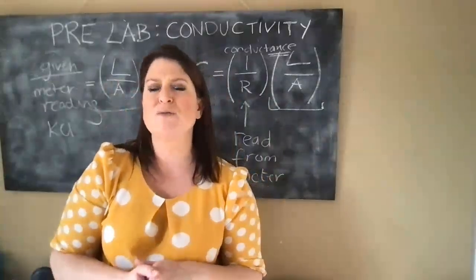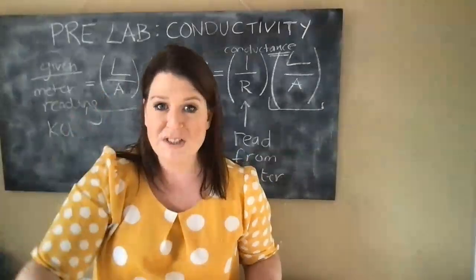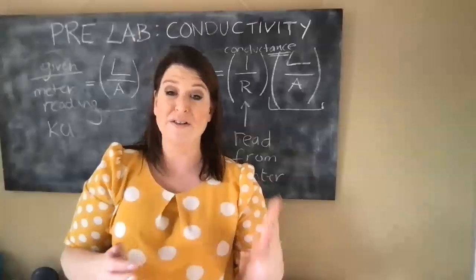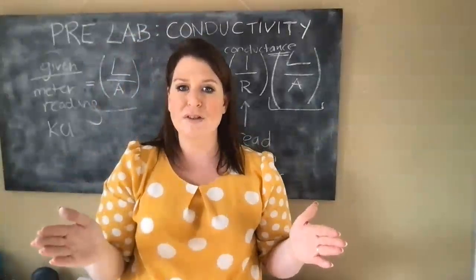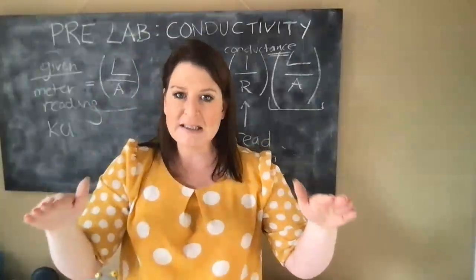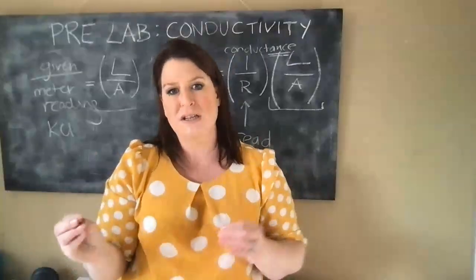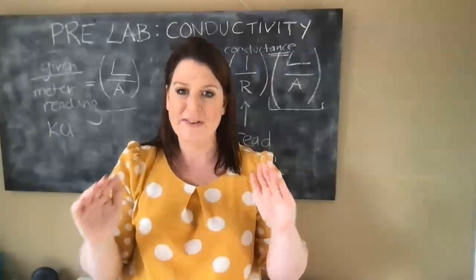So if I was to test one solution at 10 degrees and another solution at 40 degrees, even with exactly the same ions in solution, I would have different conductivity values, the more energy that was available to it. But if I want to compare and contrast different solutions, I want to make sure they're all on a level playing field. They all have exactly the same amount of external energy available to them, so that changing the energy is not in any way influencing the conductivity of the solution. I need to make sure I compare and contrast them all at the same temperature.